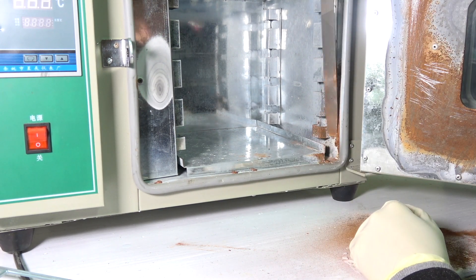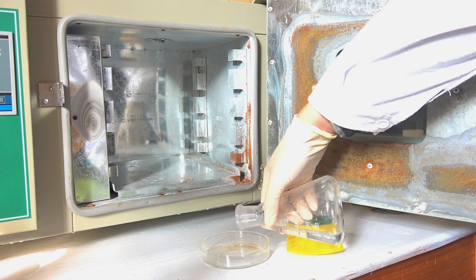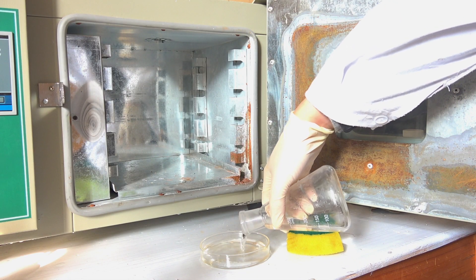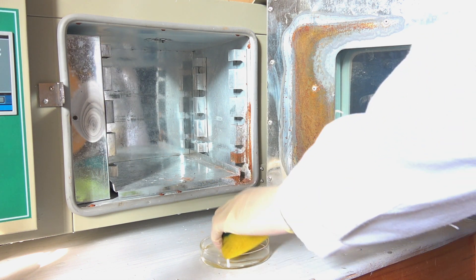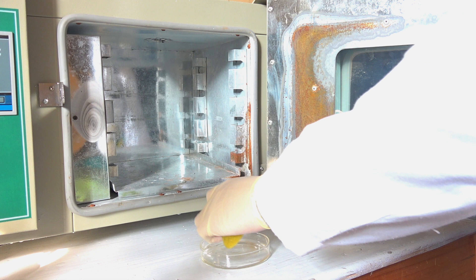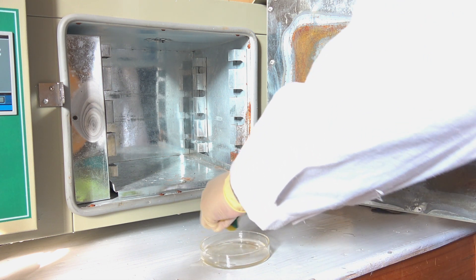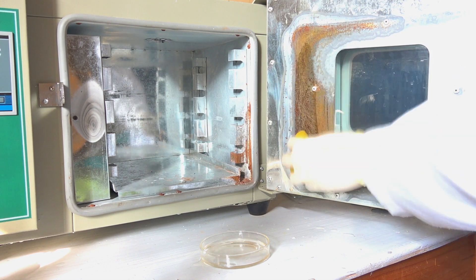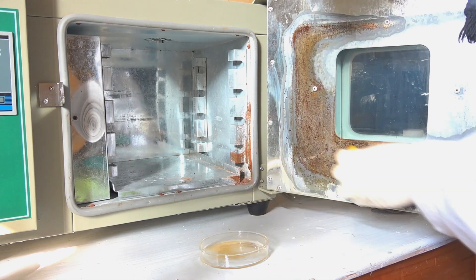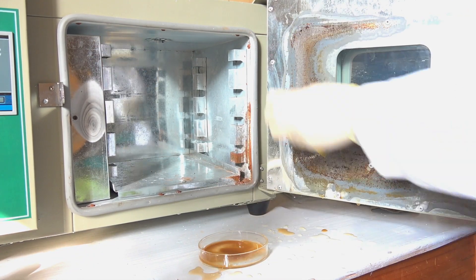After removing most of the rust mechanically, it's time to bring out the power of chemistry to deal with stubborn residual rust. Here I'm using 0.1 mol of hydrochloric acid, although the concentration isn't exactly critical. The rust reacts with hydrochloric acid to yield iron chloride, which is dissolved away. Just be aware that hydrochloric acid also reacts with iron to some extent, although the rate of this reaction is almost negligible at this given concentration.